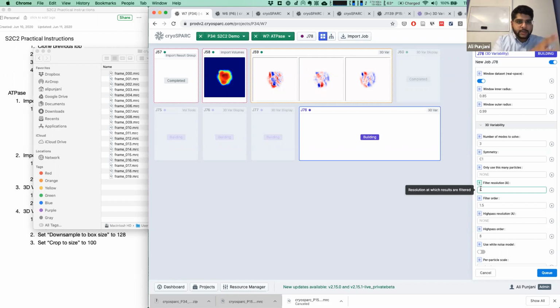On the other side, use 3D variability analysis with all the particles to verify that you found all the discrete clusters in the first place. Great. And today, our examples for 3D variability didn't include very small proteins or protein components. Can we use 3D variability on very small protein components like in the 40 kilodalton range?